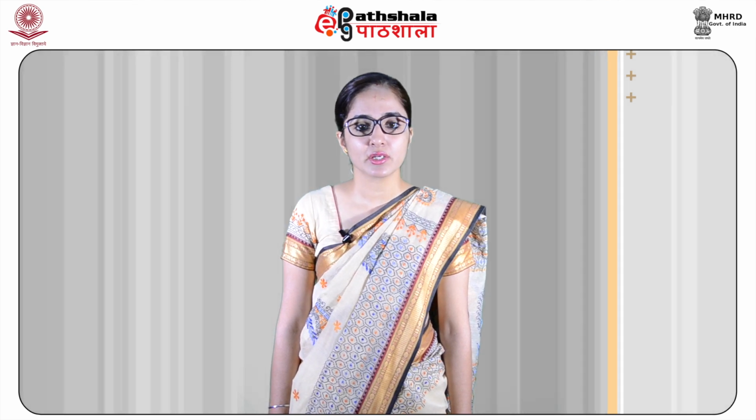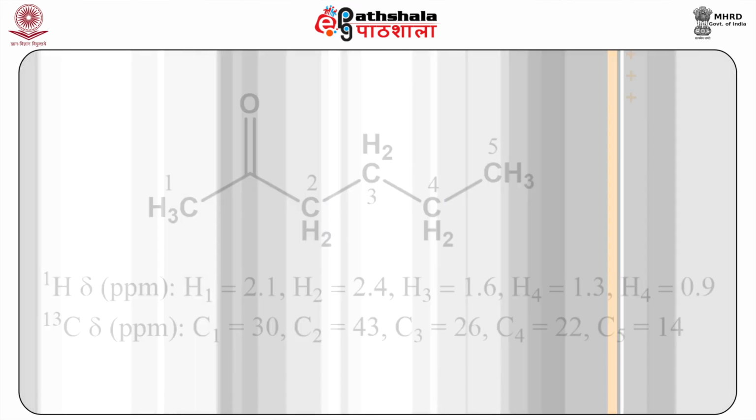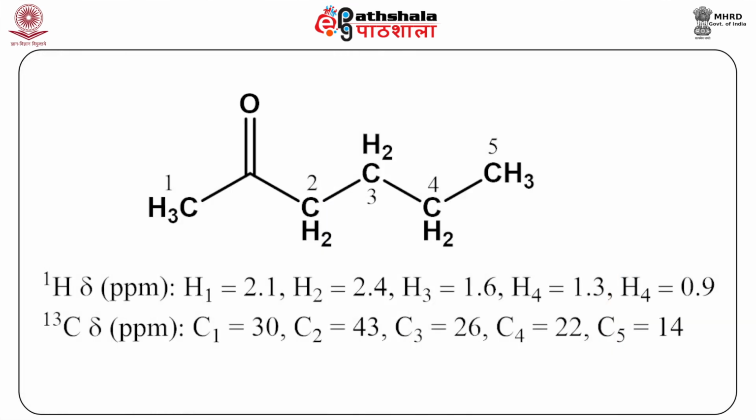By HETCOR spectrum, we can determine which hydrogen is attached to which carbon. There are no diagonal peaks in HETCOR and it is composed of only cross peaks, each relating to a carbon to its directly attached proton. Now let us look at the HETCOR spectrum of 2-hexanone again.